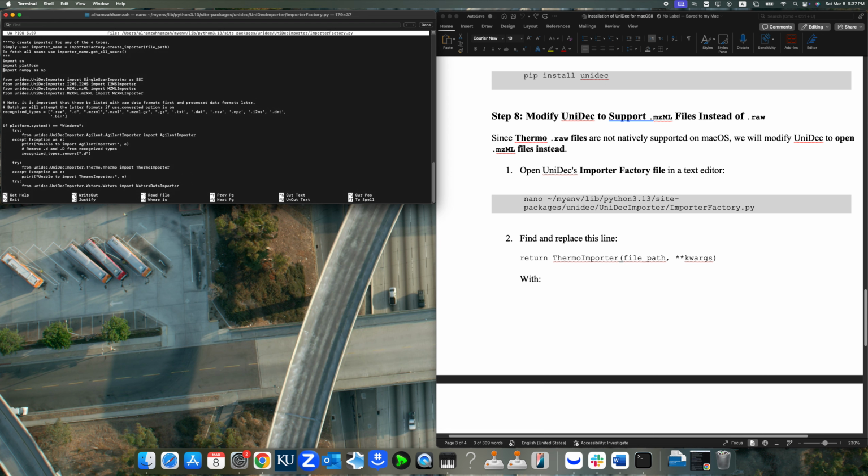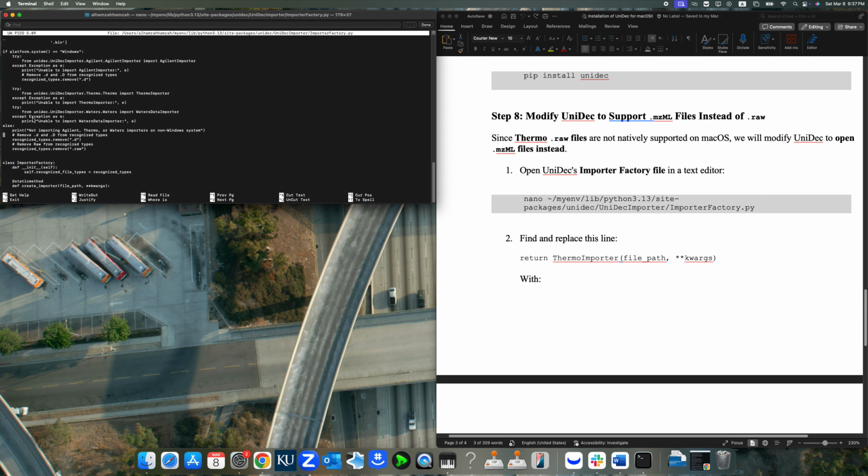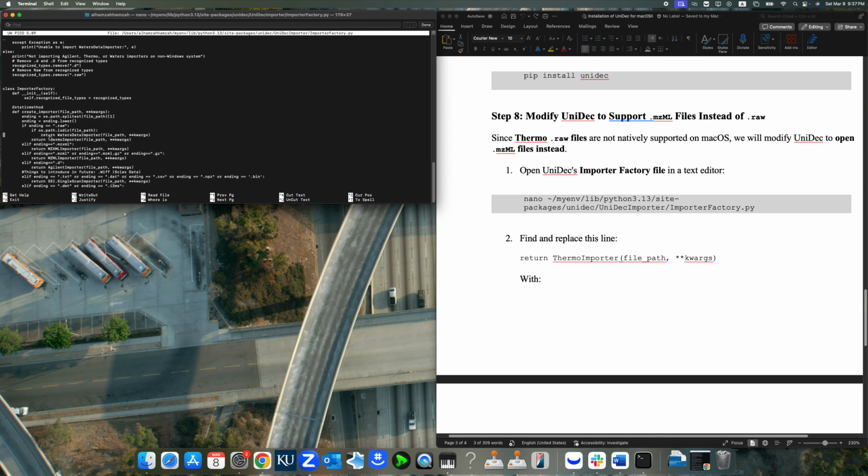It is somewhere in here. So let's find it right here. So that's the one you want to delete. So you're just gonna delete that one, or you could just put return, or you just replace it with this thing. You can copy that and just put it in.